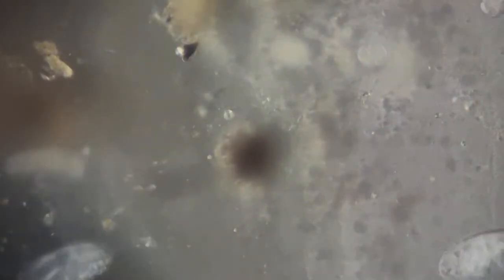Though the camera alignment has gone off the track. It's loving this debris to hide. Okay, one more time.